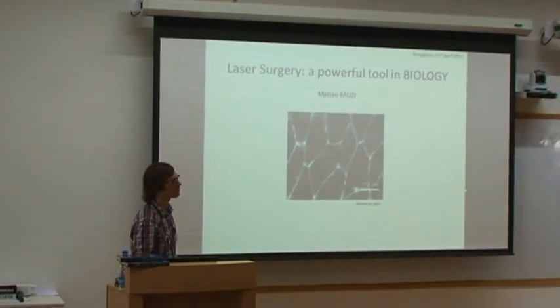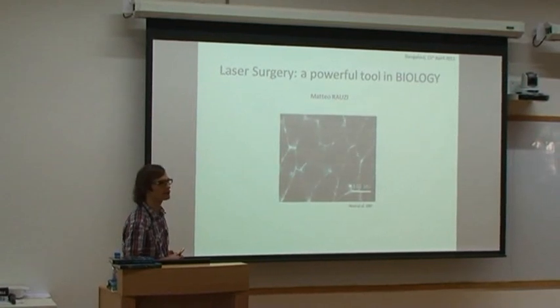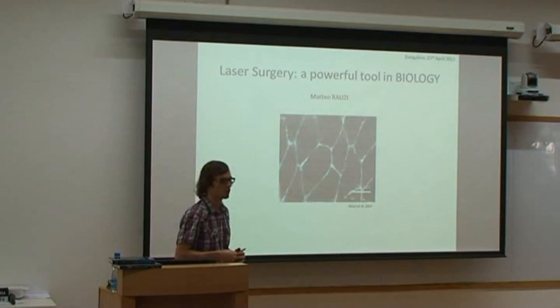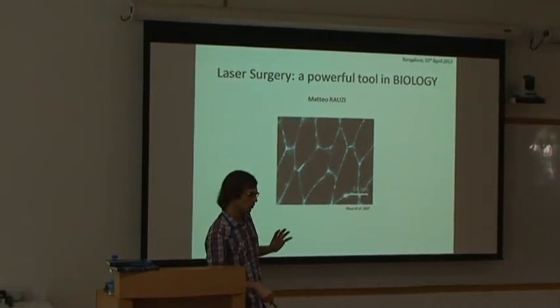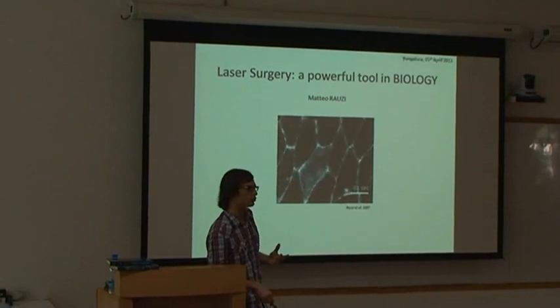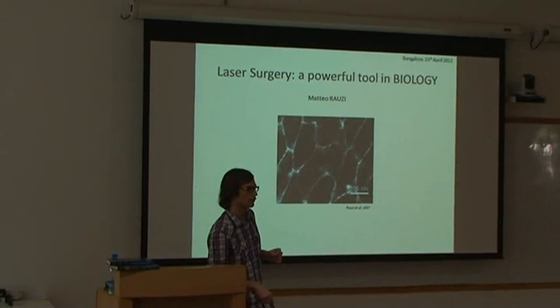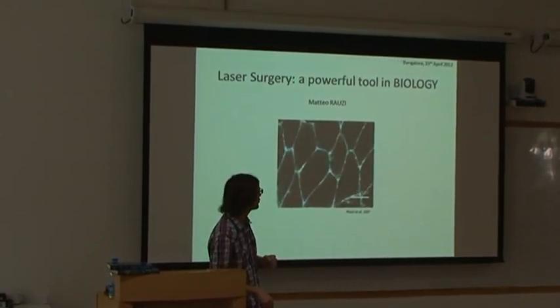Okay, so my presentation today is laser surgery, a powerful tool in biology. With this presentation, I want to show you all the parameters that you normally have to be aware of when you want to do laser dissection. So which kind of laser and which property of laser you need, and then what kind of optics and things that will allow you laser ablation.